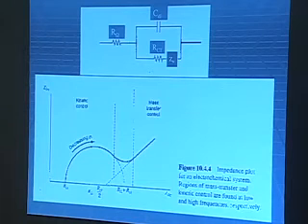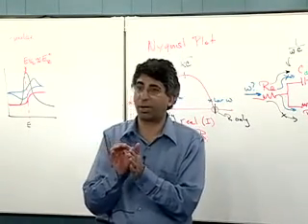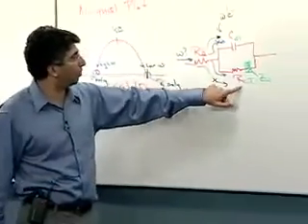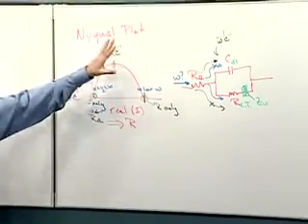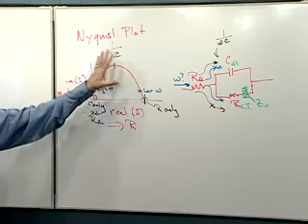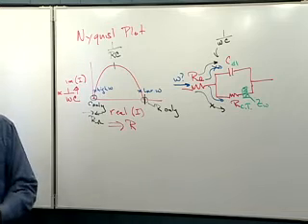All right. So, what are we going to do with this? Well, one of the big applications for this, by the way, is in corrosion studies. You have a piece of iron or whatever that is corroding away, and you would like to monitor the thickness of the corrosion layer on that piece of iron. Since the thickness will change the resistance of the interface as well as the capacitance, where the semicircle falls will tell you about the thickness of the corrosion layer. And so you can do some calibration curves. You don't even have to work out specific details. It's not important what the resistance and the capacitance is, but you just need a calibration curve that shows you how this semicircle shifts as the corroding layer gets thicker. And so you can monitor a corrosion rate by doing this, by monitoring this over a period of time.